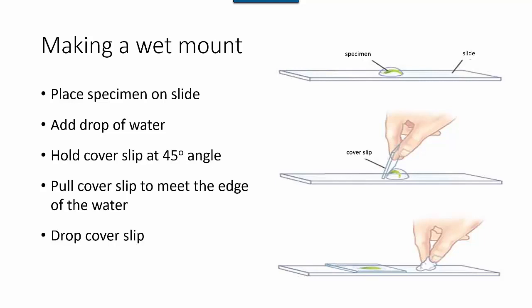For this, there's no specimen to place. The specimens you'll be viewing are already suspended in the water. You'll just need to put a drop of pond water on the slide and place a cover slip like I described.